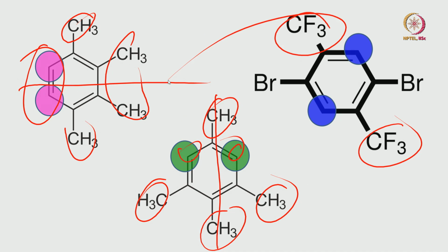Look at the examples I have given in the phenyl substitution: mono substitution, disubstitution, symmetrical and asymmetric trisubstitution, tetra substitution. We have different chemical environments. As a consequence, we understood how many peaks we are going to get in mono substituted benzene, symmetrically disubstituted ortho, meta and para, and symmetrically trisubstituted. So, this is the beauty of this thing. Chemical equivalence we understood.